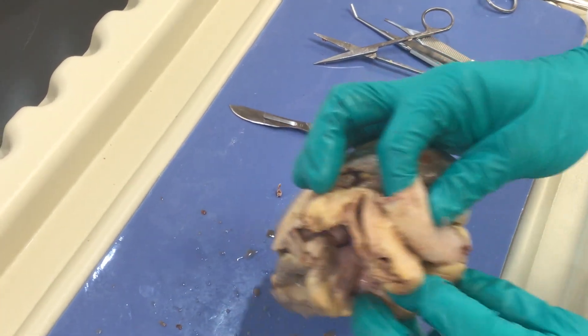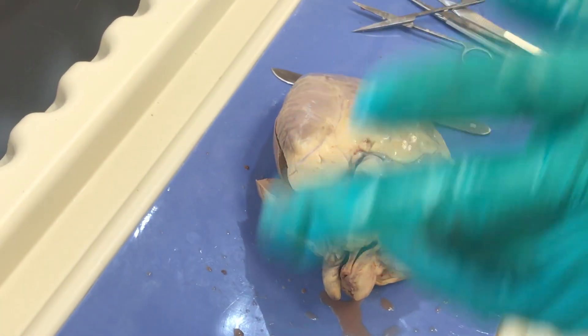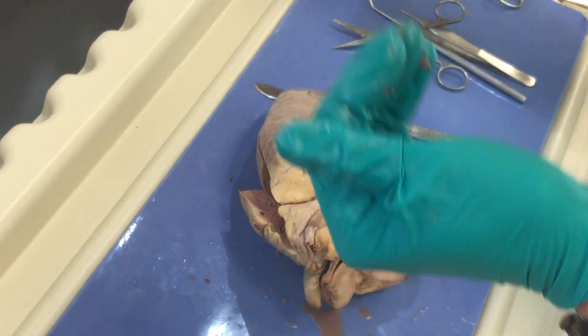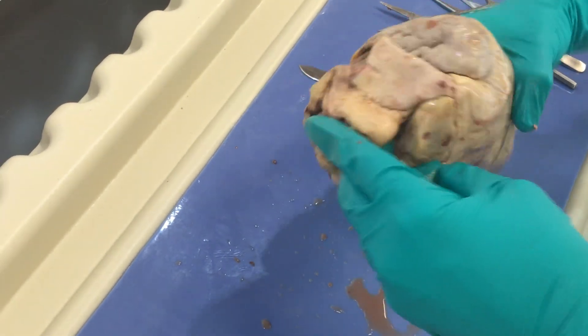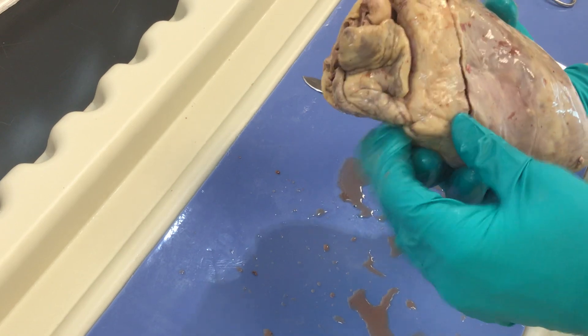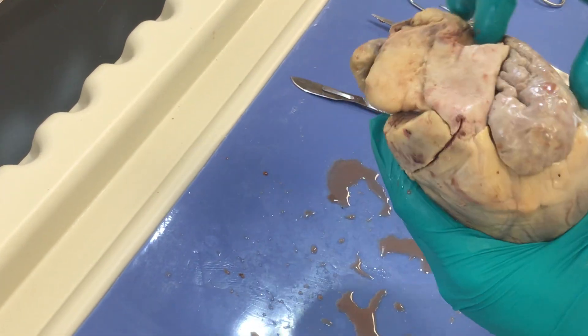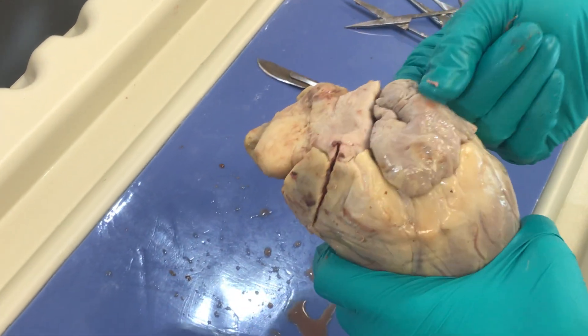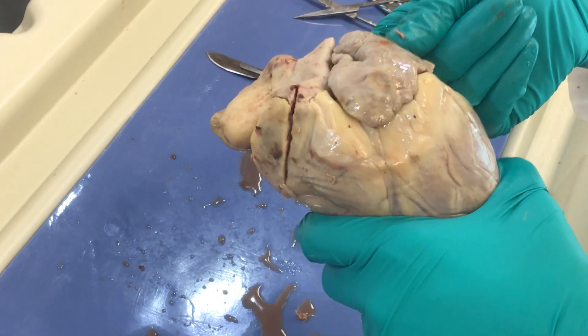The pulmonic trunk is going to divide into pulmonary arteries — remember, arteries go away from the heart. Those will go to the lungs. We're going to pick up oxygen and return to the left side of the heart. Let's orient right side to left side. I'm going to turn it this way and I can actually see my pulmonary veins emptying here into the left atrium and auricle. That's my left auricle.